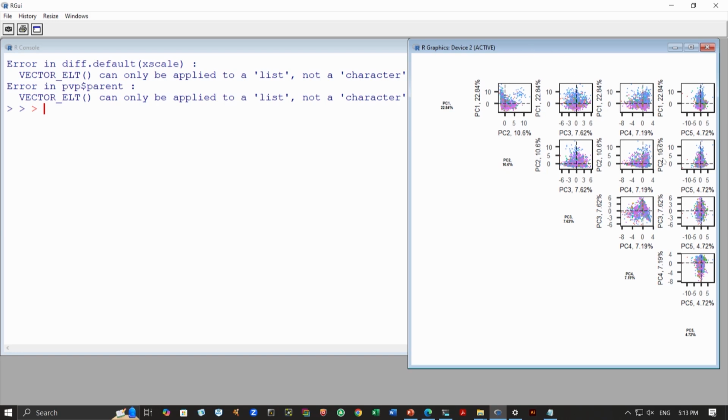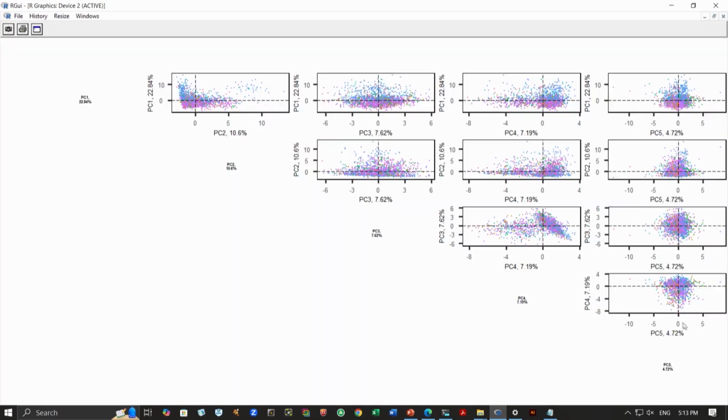What you probably notice is that PC1 is separating out the purple and blue clusters, whereas PC2 is restricted to separating out only these blue ones here. They are not able to separate out any other clusters, except perhaps this pair a little bit. If you look carefully at PC4, PC5, there is some sort of separation, with the green ones towards the right.